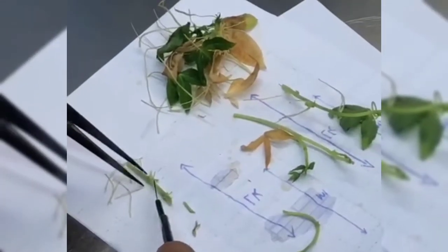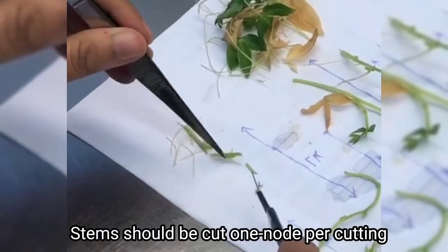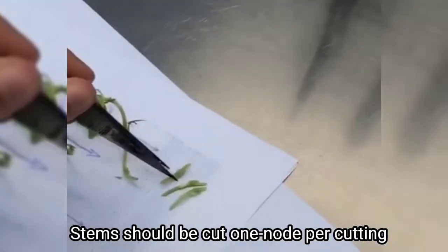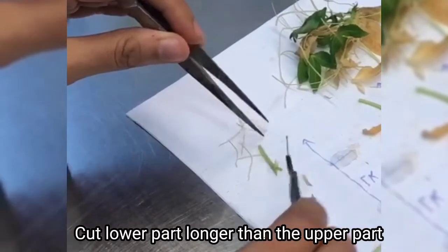Here are a few points you need to note while cutting. The first one is the stems should be cut with one node per each cutting. Then you must cut the lower part longer than the upper part.